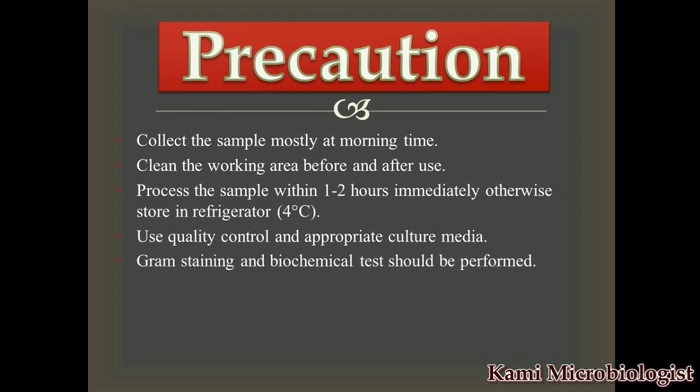Once the bacteria is identified, most technicians will ignore the gram staining and biochemical tests, because they have some expertise, and by examining the colonies they will say that it's gram positive or gram negative, and it may be Klebsiella. It is not acceptable to just predict the organism. You must perform the biochemical test and gram staining, because it's very important to identify and confirm the bacteria. Then we can easily provide the appropriate treatment.